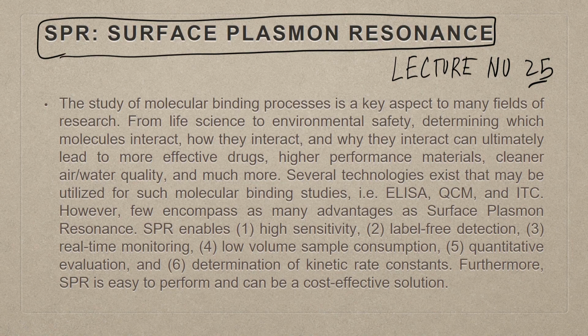So, what these technologies are, when we talk about them from the biosensing perspective. There is an antigen in the form of a toxin, in the form of a protein, in the form of spores, in the form of a cell, and you have a recognition element which binds to it, right? So, you have to understand this binding. When there is a binding, there could be electron transfer.